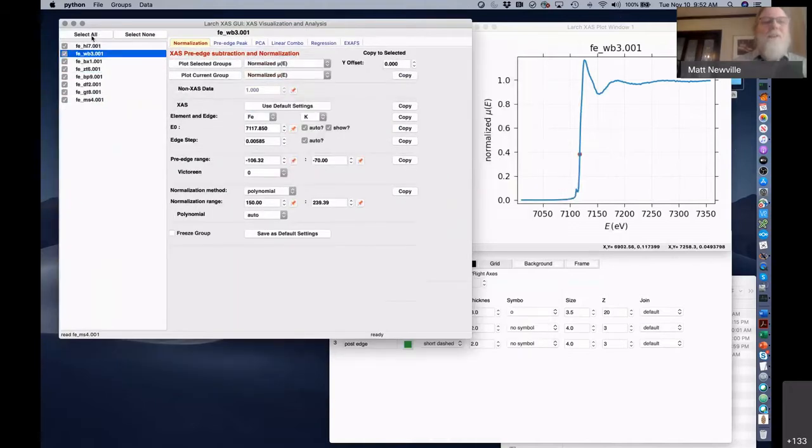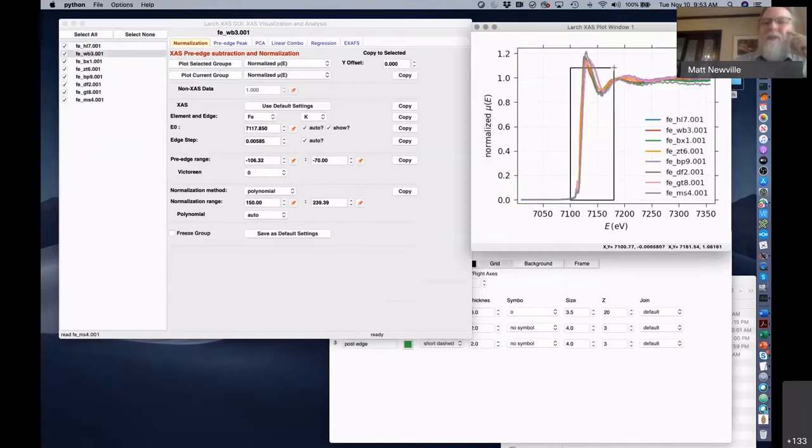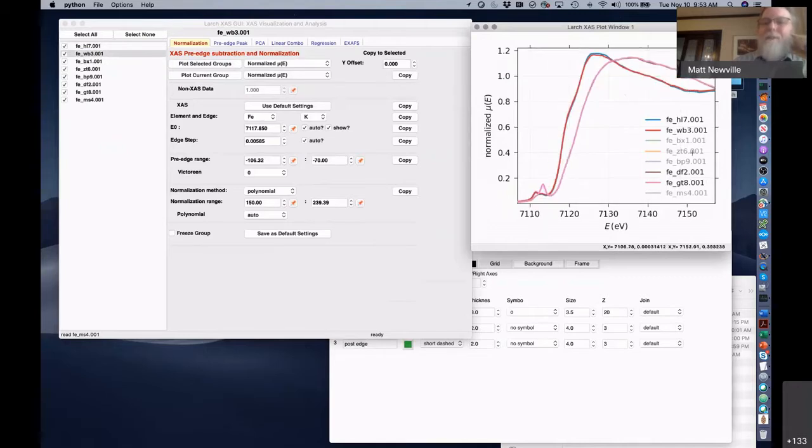For here, this is a pile of Zane's, or a good representation of Zane's data. It's definitely not 1,000 spectra, but if you put all those together, you'll see that there's a good set of consistent values, but quite a bit of variation between them. In fact, I think there's sort of two main sets of data and then some in between. So there's clearly, for those of you who know, some iron 2+ and iron 3+, and then some states that are sort of mixed in between.